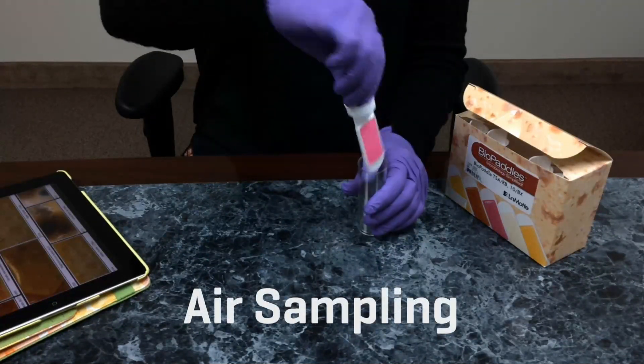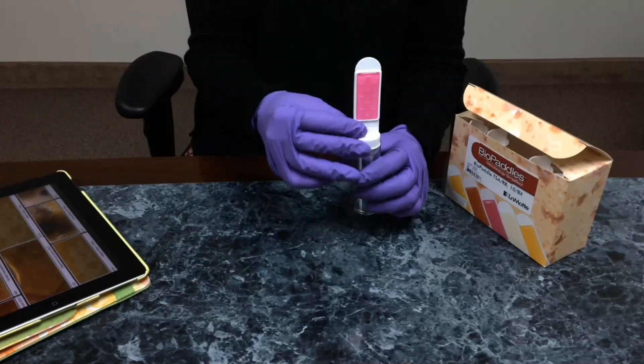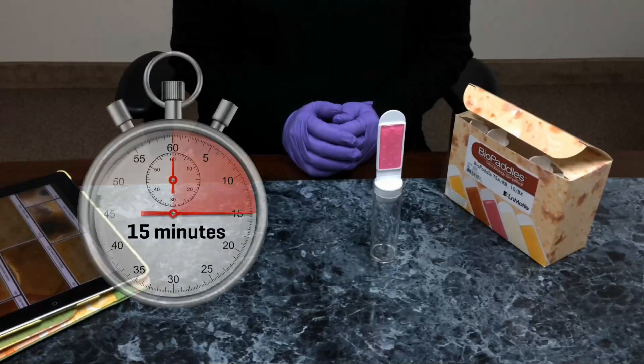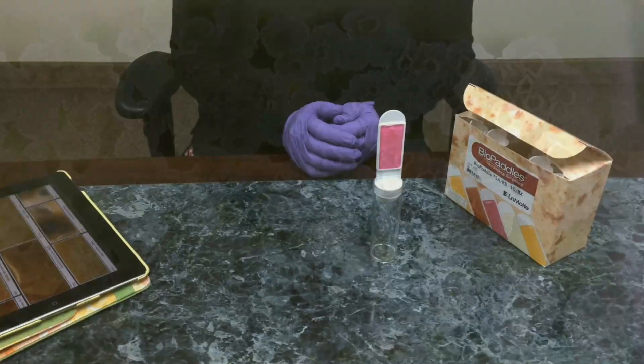Bile paddles may also be used to sample air. Remove the paddle from the vial, invert the paddle, and insert the cap into the vial to expose the agar to the air. Expose for 15 minutes. Reinsert the paddle and incubate following directions.